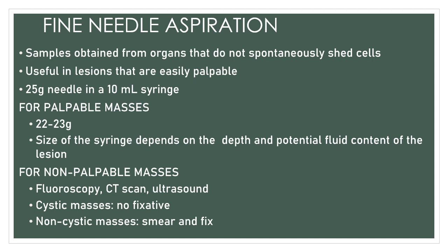For cystic masses, if you already obtained a sample, do not add fixative. You bring the sample to the laboratory as is. For non-cystic masses, you prepare a smear and then fix it using a spray or other fixatives. So that is for your fine needle aspiration.